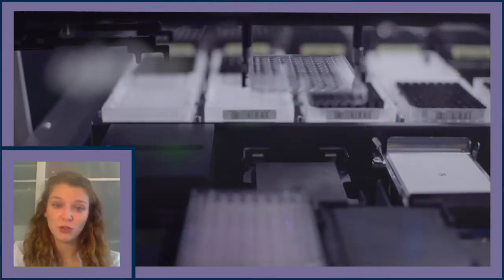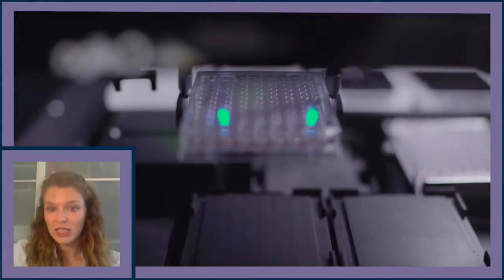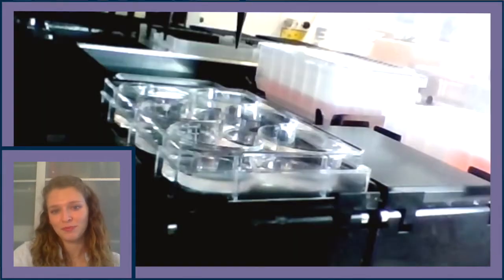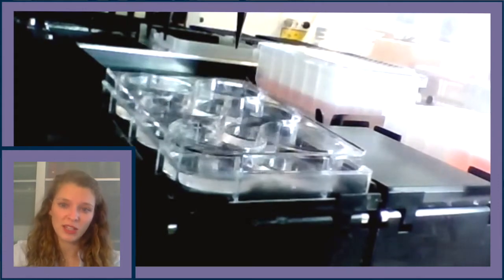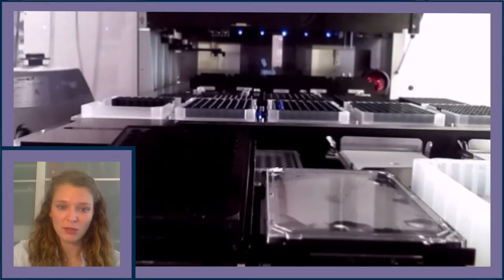We'll start by showing the matrigel coating of plates, the dissociation of a source plate, seeding onto glass assay plates and plastic expansion plates, and finally end with the automated feeding and imaging of plates. Important to note, we use six-well plates for cell expansion and 96 glass bottom plates for imaging assay plates.